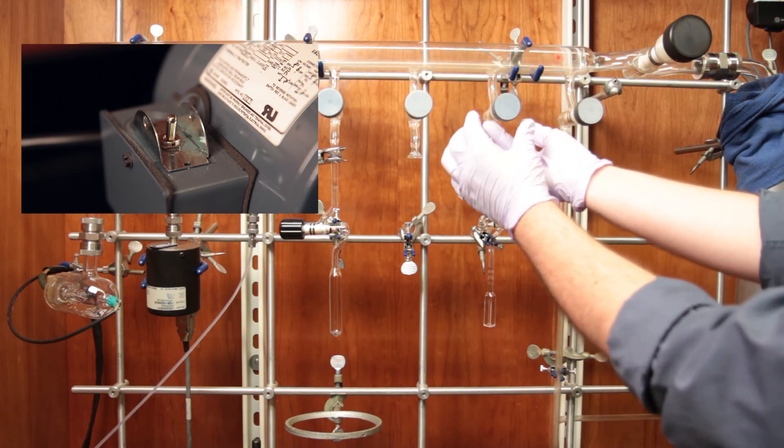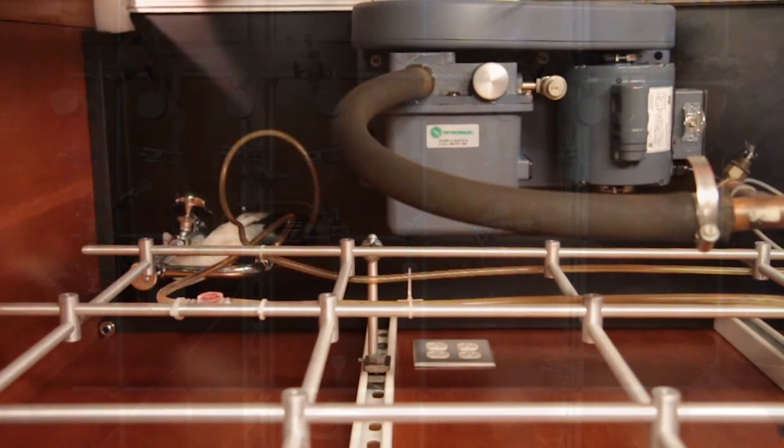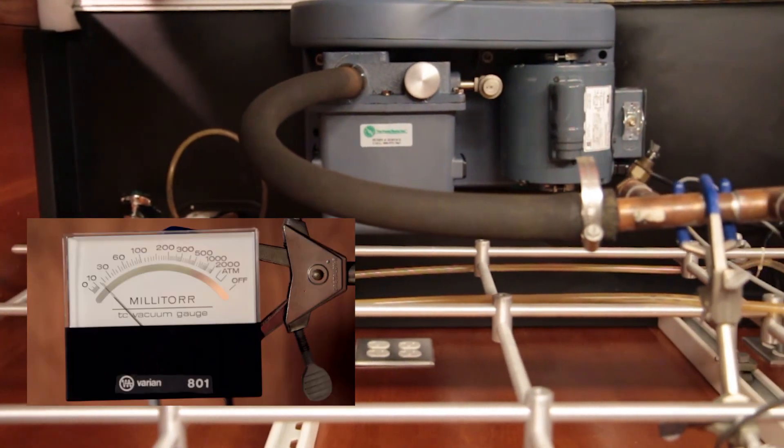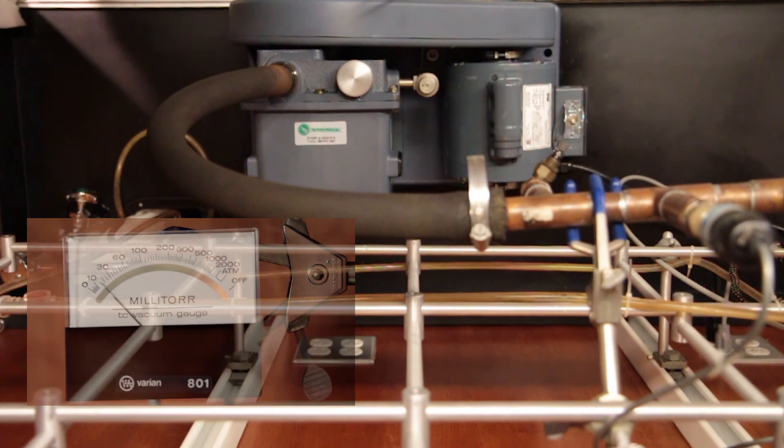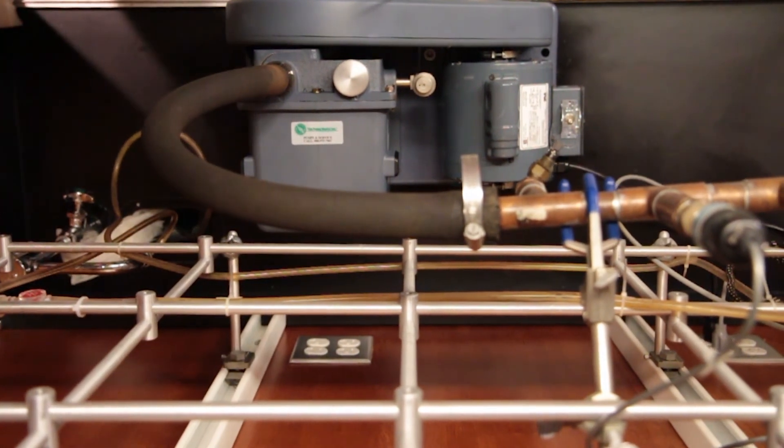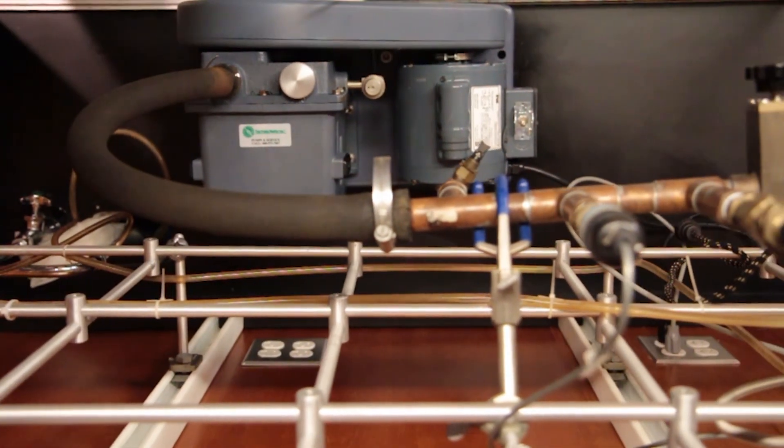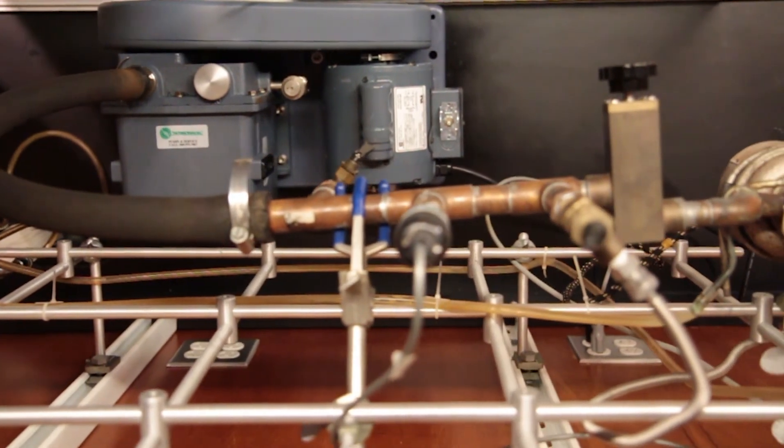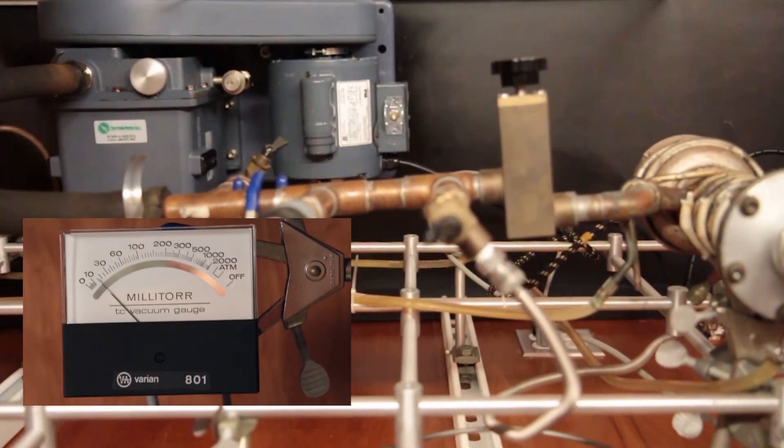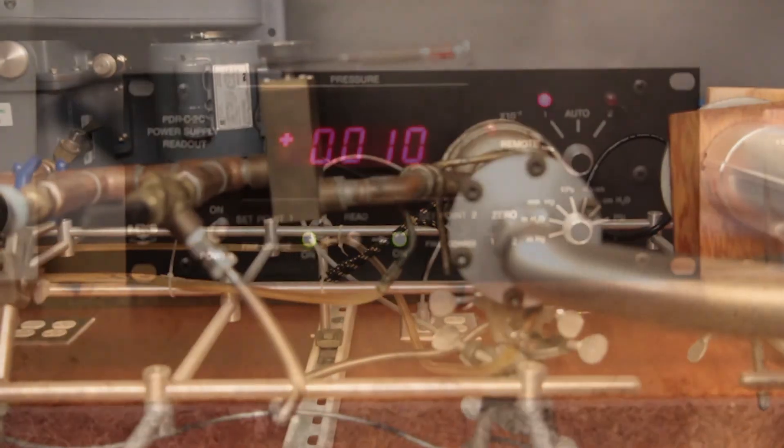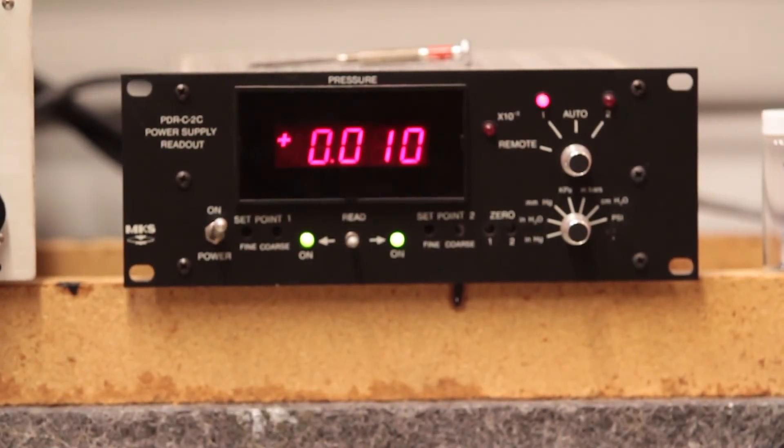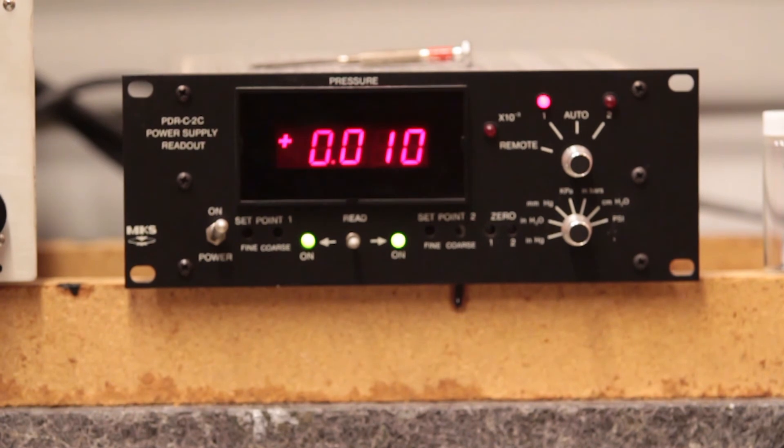The rotary vane pump will bring our pressure down to less than 100 millitorr, which is sufficient to start the diffusion pump. This vacuum gauge is connected near the diffusion pump and is used to make sure the working pressure is always low enough that the diffusion pump functions properly. We have a second vacuum gauge that is connected directly to the manifold. We'll use this gauge to monitor the pressure of the gas that we're putting into our sample cell.